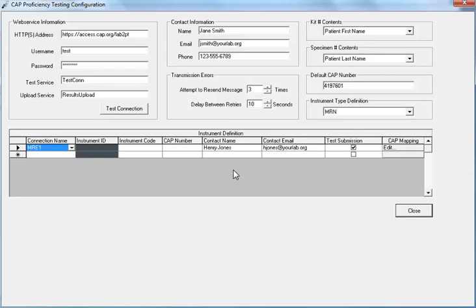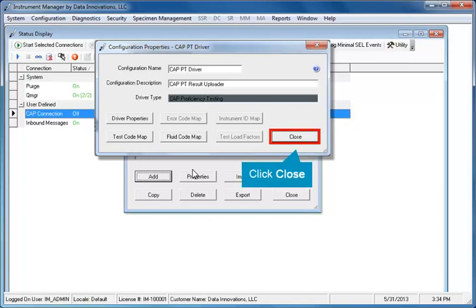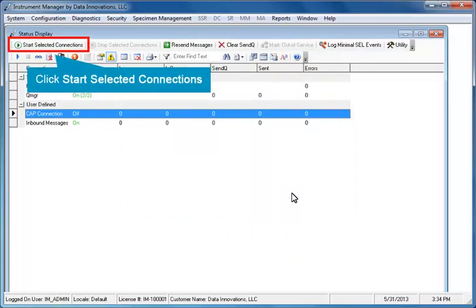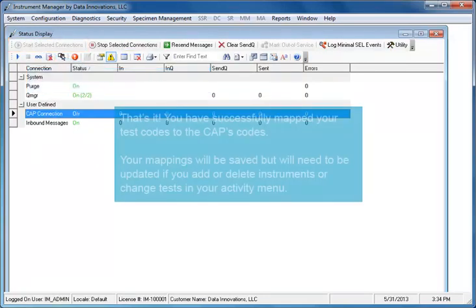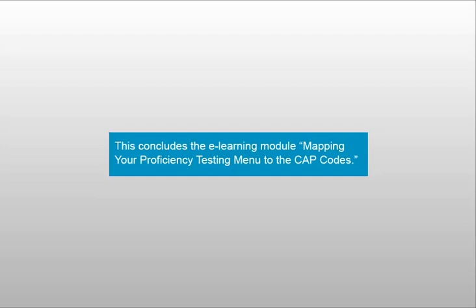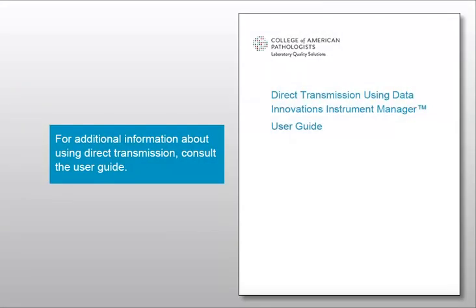Close all the remaining windows and then turn the CAP Proficiency Testing Driver connection back on. That's it! You have successfully mapped your test codes to the CAP's codes. Note that your mappings will be saved, but will need to be updated if you add or delete instruments or change tests in your activity menu. This concludes the eLearning module Mapping Your Proficiency Testing Menu to the CAP Codes. For additional information about using direct transmission, consult the User Guide.